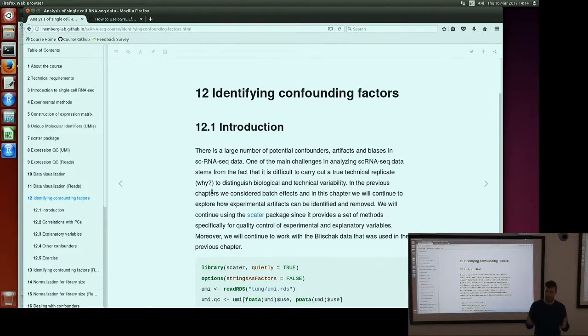The measurements made are different, and we can notice that. The same is also true for single cells. Depending on the plate that your cells appear on, or when they were processed or who did the processing, we can see large-scale differences in measured expression levels that we can pin down to technical or experimental artifacts that we're not interested in and would ideally like to remove as sources of variation from the data before we try to answer biological questions.